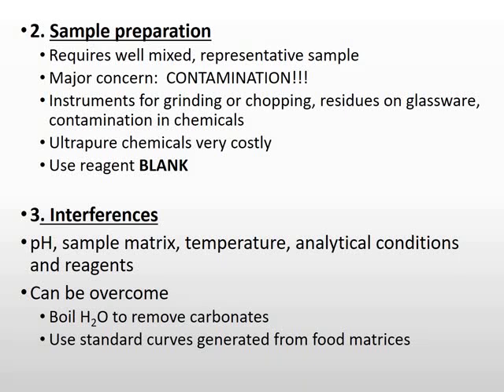Okay. And then also in sample preparation, obviously the purity of your chemicals is very important. And then also the use of the blank reagent. I'll talk about that just now.